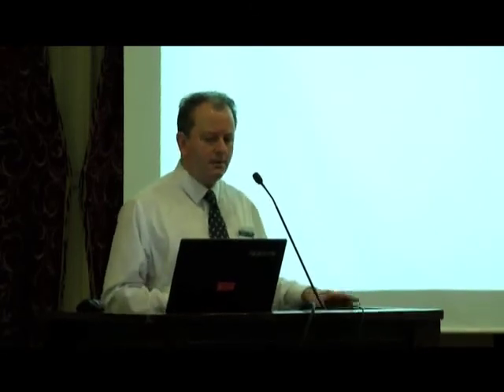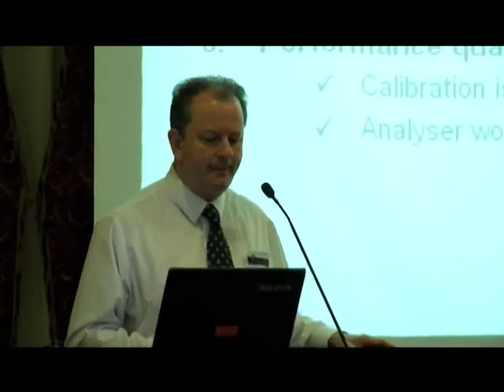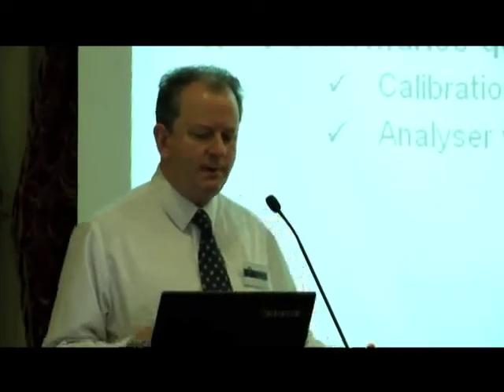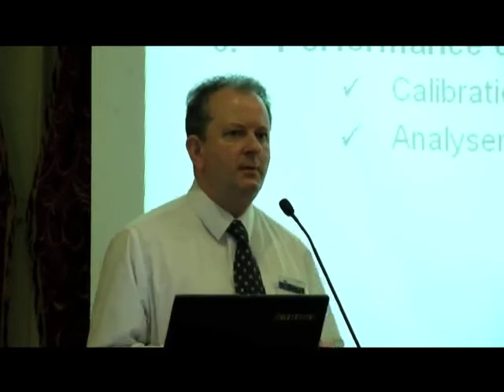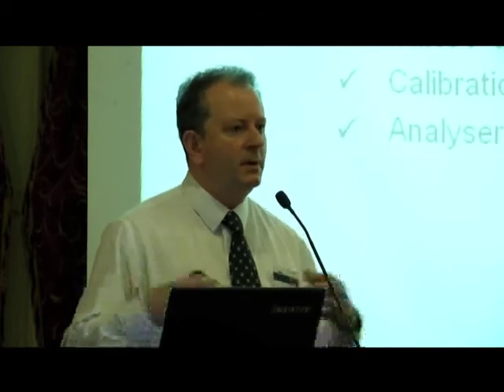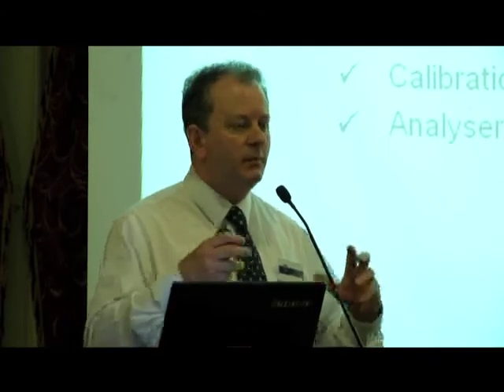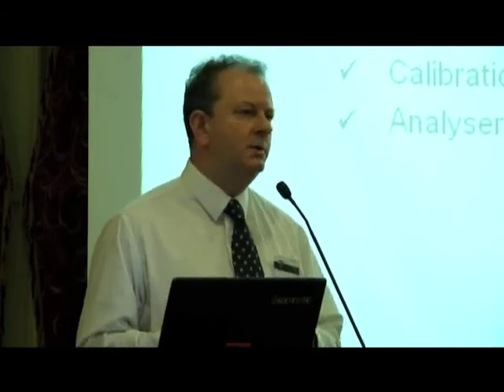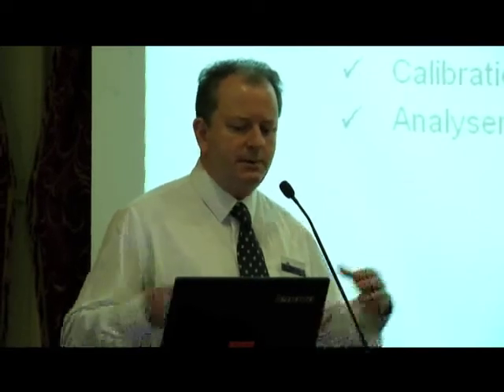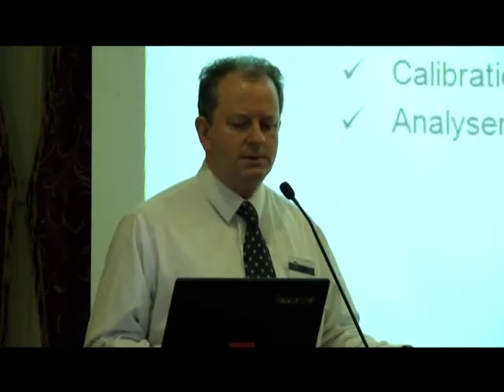System suitability, I will talk about that a bit later. And of course, any signals 4 to 20 milliamp or serial connections to remote systems need to be verified. And then, of course, you go into the performance qualification stage. Now, really what we're looking for here is to make sure that the analyzer will reliably perform its job over an extended period. Some TOC analyzers require a lot of frequent calibration. Others, you can extend the calibration period, and you do that using the performance qualification.